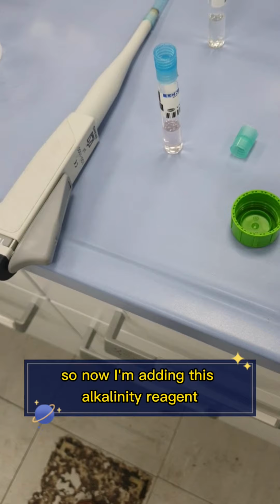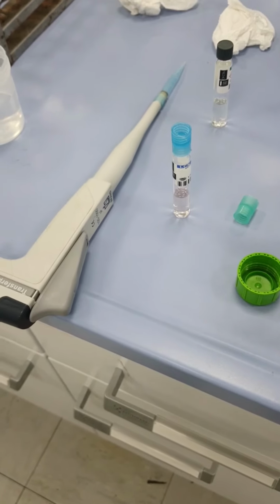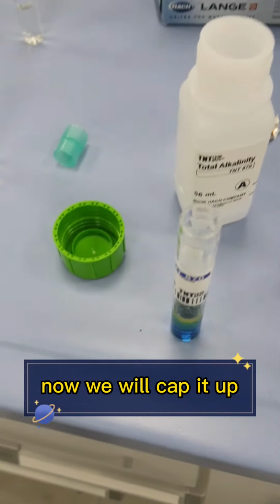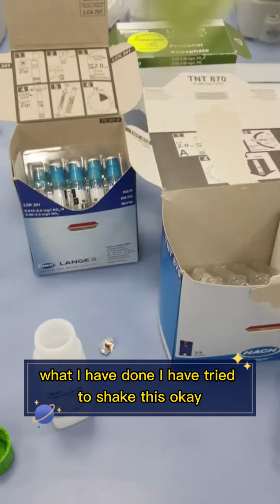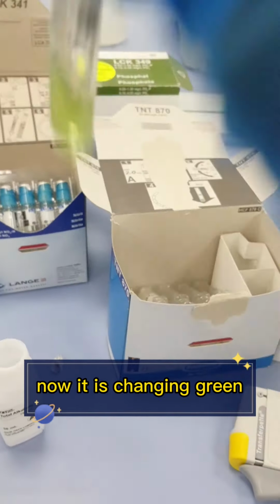So now I'm adding this alkalinity reagent. Okay, you see there is a color change here. Now we will cap it up. After capping it, I have tried to shake this. Then you can see it was earlier blue, now it is changing green. So this is our endpoint.